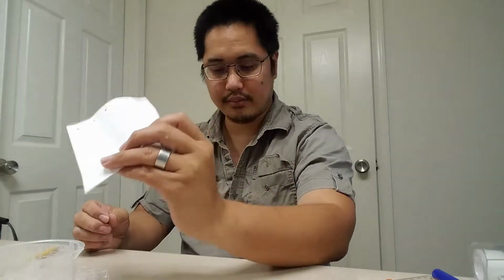You want to repeat this about 4 or 5 times. Now I'm not going to do this all 4 times because, again, this is a demo.